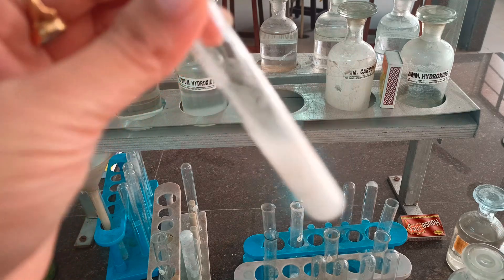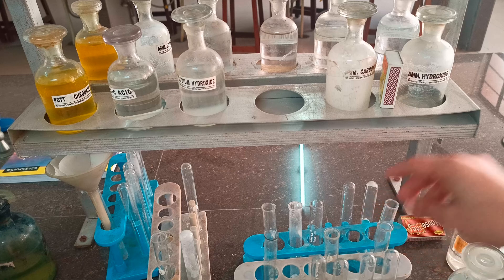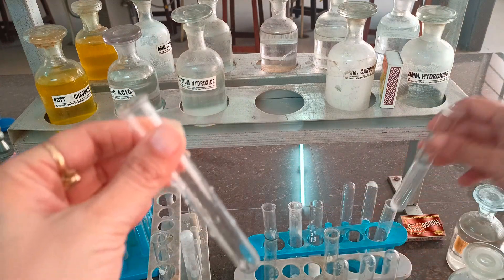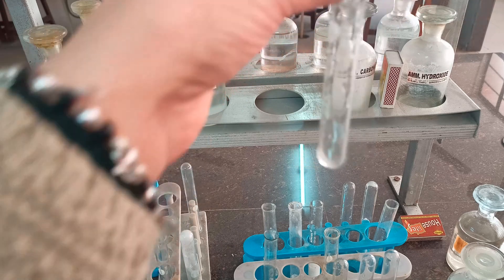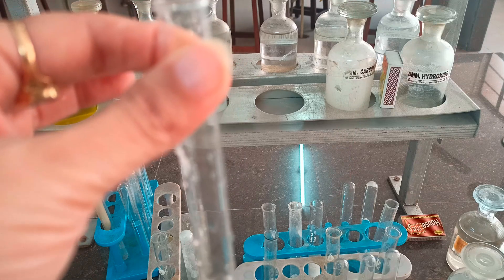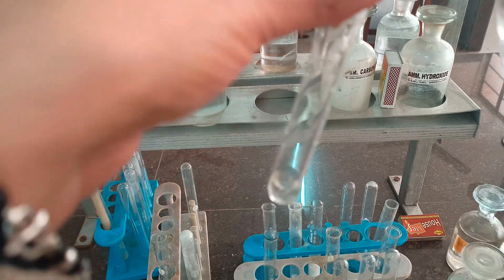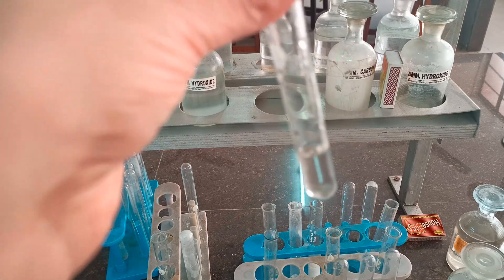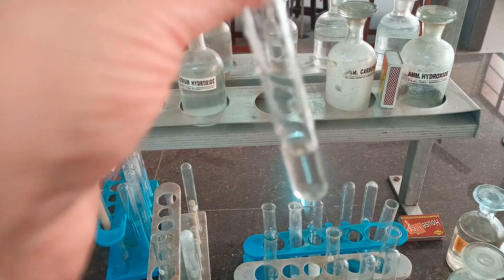Now we proceed for the basic radical. The basic radicals are divided group-wise. Starting from Group 1: taking aqueous solution and adding dilute hydrochloric acid. You can see no precipitates are formed, so Group 1 is absent.